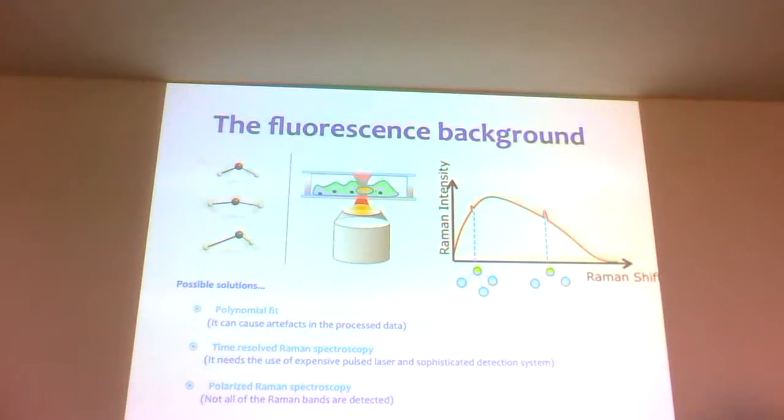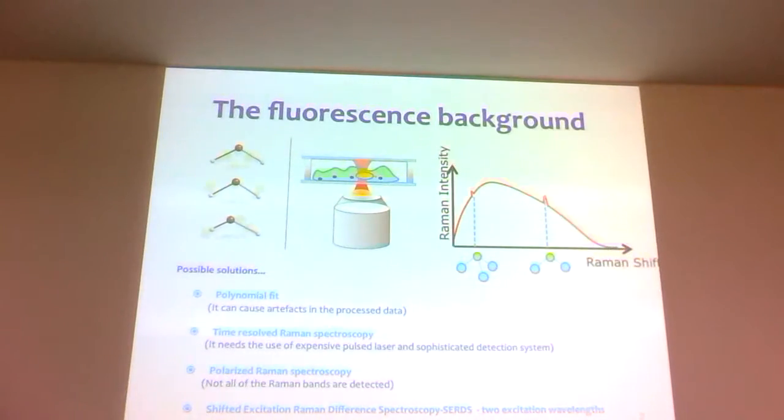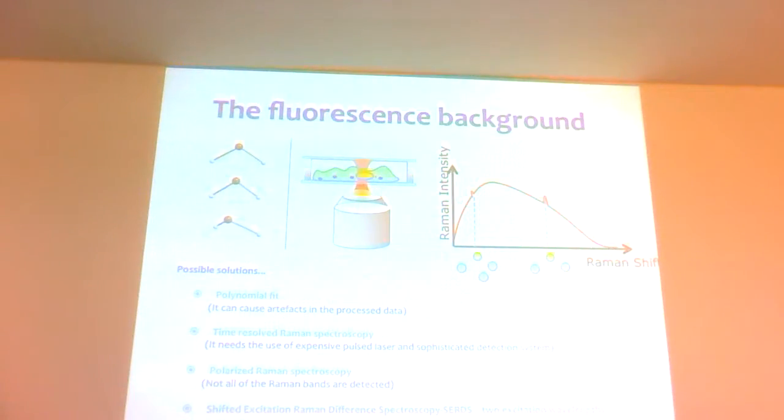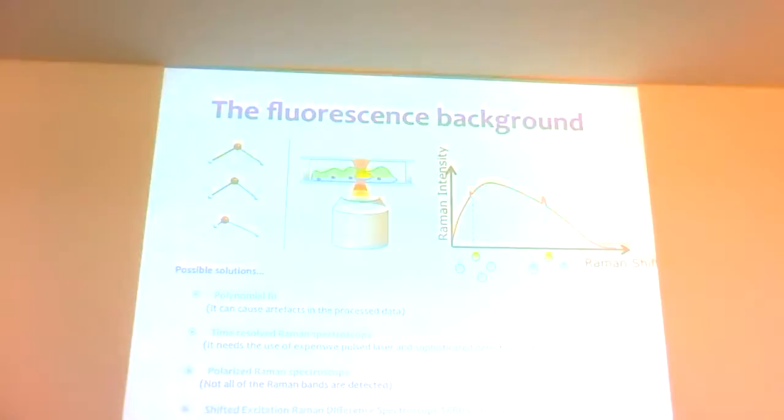Now let me show you some physics in shaping in space. So here, for example, we've got our Raman, but we've got that big fluorescent background. Remember the fiber probe? Remember that massive signal that we had? So here we have a real kind of Raman spectra. And usually, you see those two little blips, that's the Raman spectra that you have, and usually a massive fluorescence background. Now, there are many ways that you can actually remove that. I could use a mathematical analysis. Now, if I gave everybody a computer and a piece of software, you could all go away and work out a curve that might fit some random fluorescence background. Okay? It turns out that there will be some statistical variation between the number that you pick. And also, your fit might change depending on the relative weighting of the Raman signal you have. So you might have to be a little careful with that.